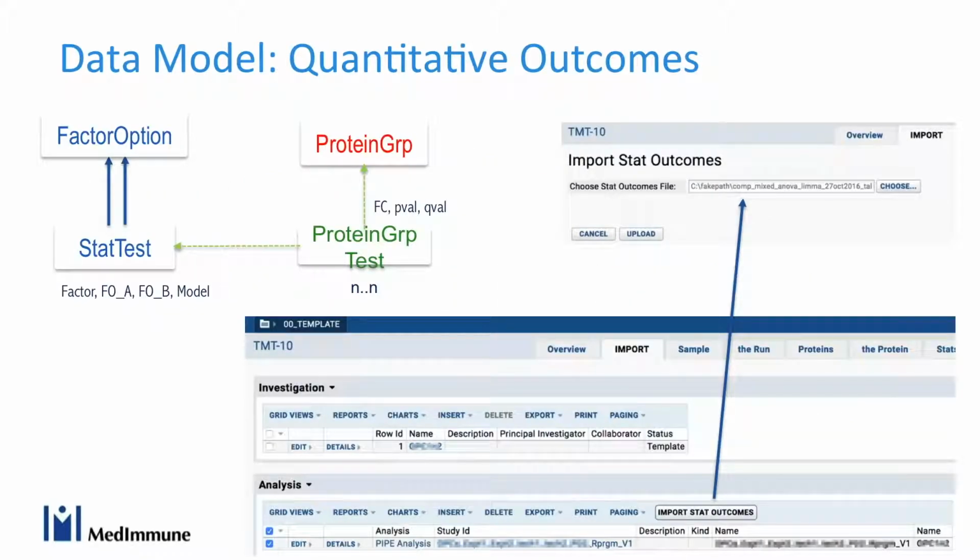Following the data loading, we also have a dedicated effort to do the statistical testing. Basically, you run the protein quantitation, but then you really want to find out which protein has changed significantly from one condition to the other. We have our statisticians that set up these models and do all this testing. At the moment, we're doing the stats outside of LabKey because we do not feel comfortable that we can actually have a candidate pipeline to do that.